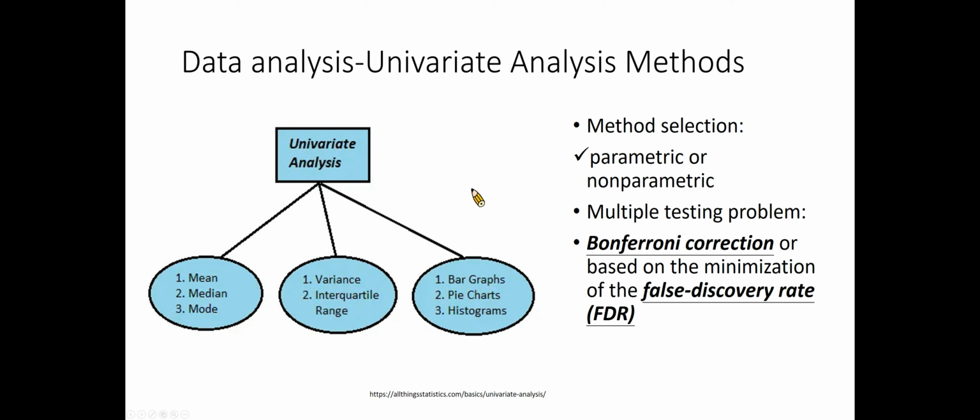Univariate methods analyze metabolomic features independently. They are common statistical analysis approaches, and therefore, their main advantage is their ease of use and interpretation. However, the main disadvantage is that they do not take into account the presence of interactions between the different metabolic features.